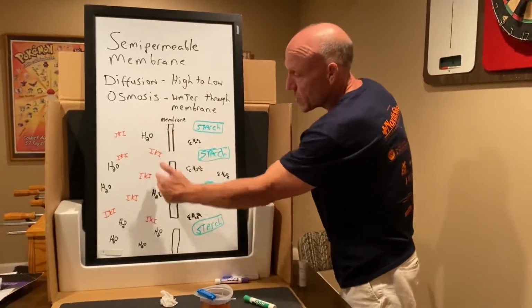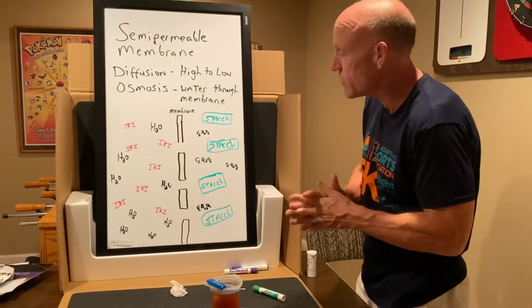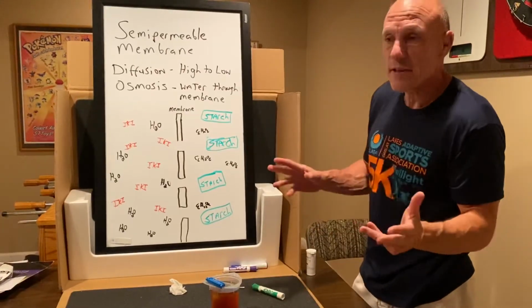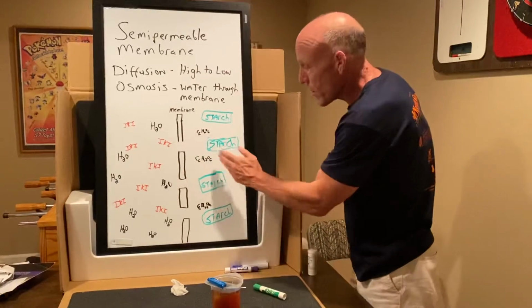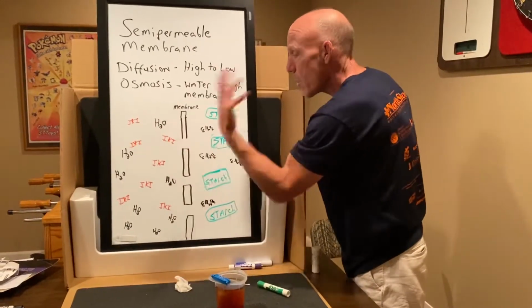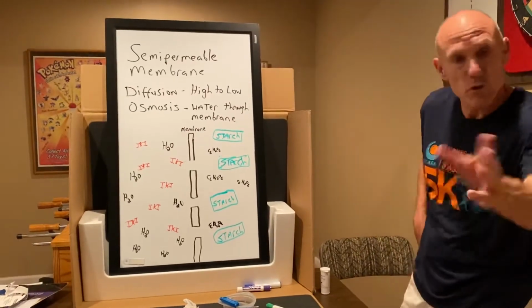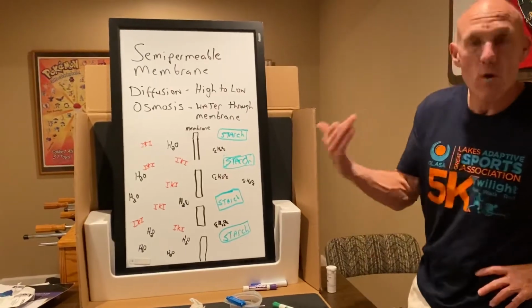On the outside of my beaker is these iodines. These KI stand for potassium iodide. No worries. We just need the iodine, and that's the form it came in. Now, these molecules are going to want to go from high to low. The iodine molecules in the water want to go from high to low. How are we going to know what they've done? This experiment is just qualitative. We're just going to change the colors. And when we change the color, we'll know what went where.